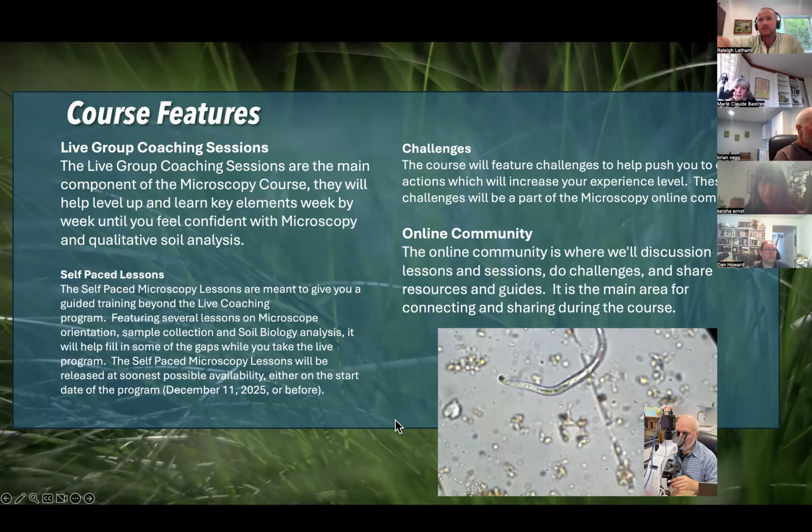Imagine spending hundreds of hours alone at a microscope. It's boring. It's kind of lonely. But doing this together, you're part of a group of very experienced microscope fanatics, and you learn together with expert-level training.